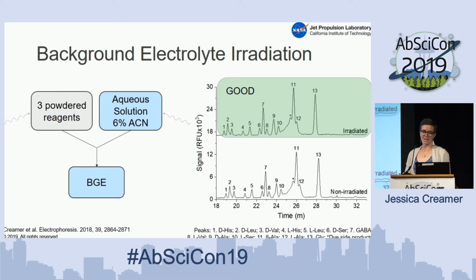We also irradiated the background electrolyte, and we found that as long as we keep the powdered reagents separate from the liquid reagents during the irradiation and then mix them for analysis, everything is fine. We don't see any effects in migration time drift or difference in resolution between our peaks. And this just means that we have to have a sample handling system that can keep the liquid and the solid separate until we're ready to use it.